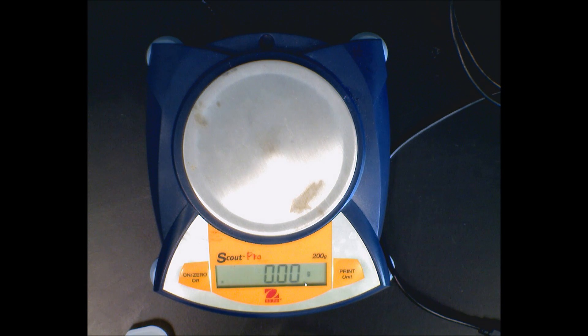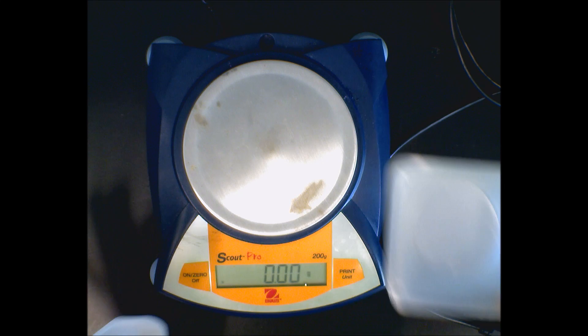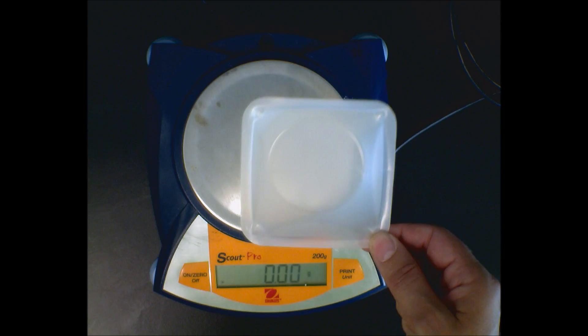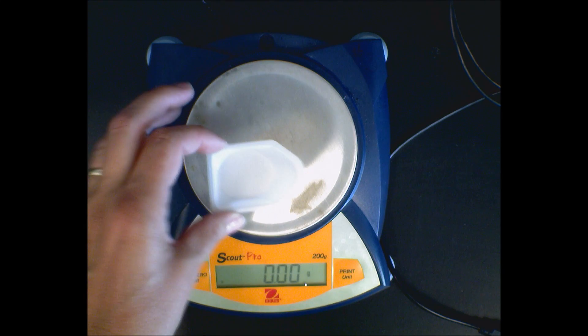Now, you never put chemicals directly on a balance because it can contaminate it, get chemicals in it, and could ruin the metal in the balance. So there are these things called weighing boats. They come in different sizes and different shapes. This one would hold quite a bit. This one looks more like the named boat.